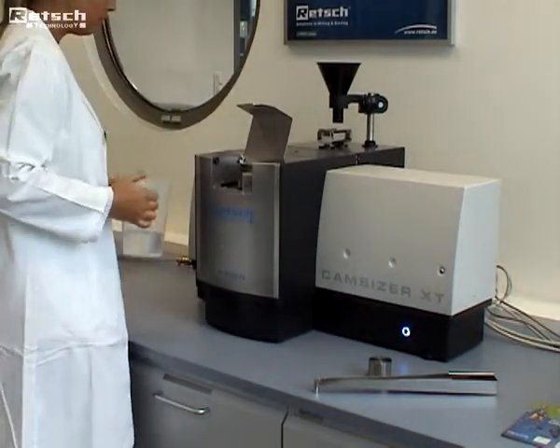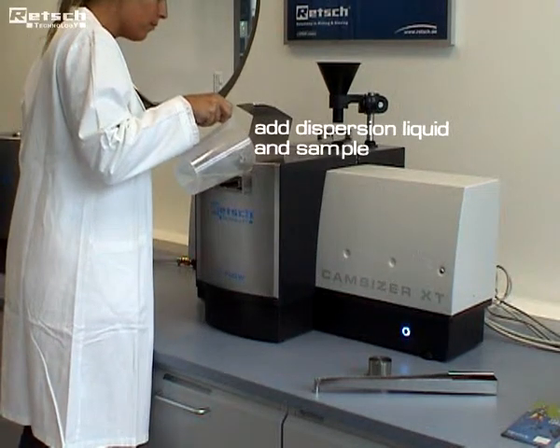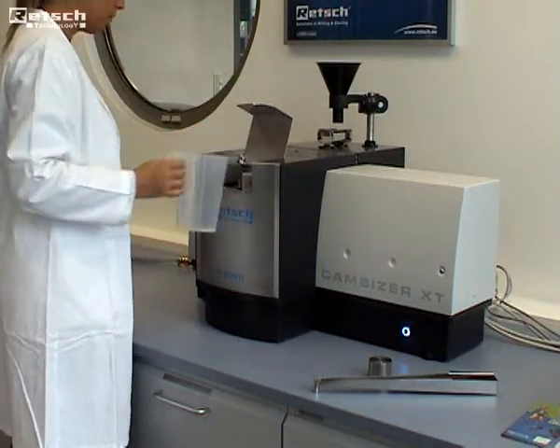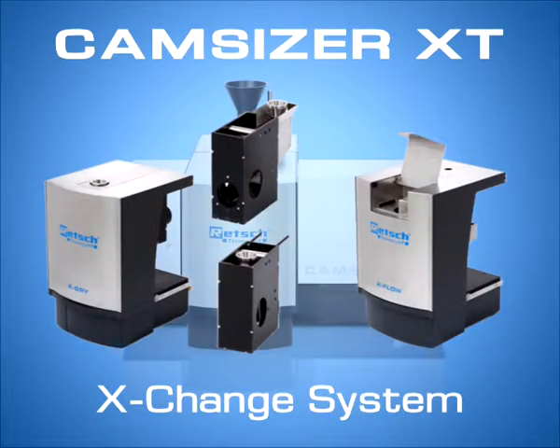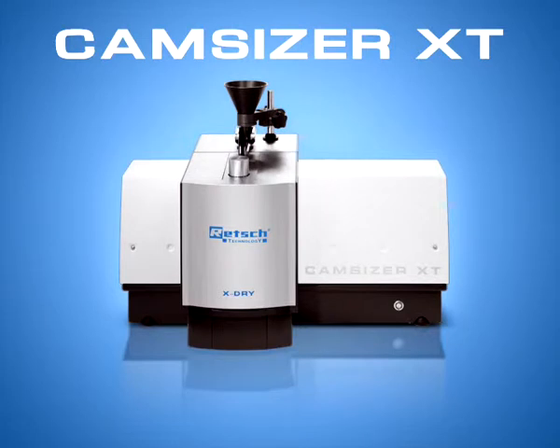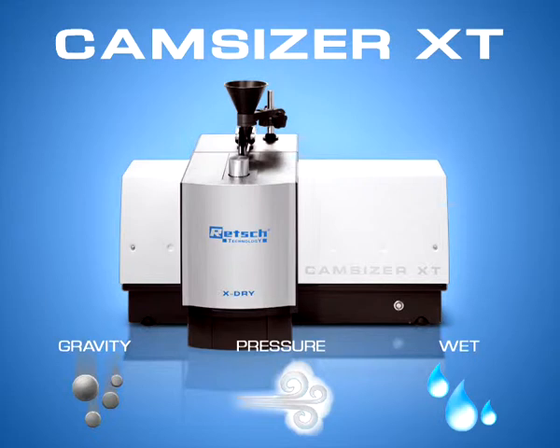After the dispersion liquid has been added, the sample can be fed and the measurement can be started. Using gravity, high pressure, or wet dispersion makes this instrument the ideal choice for precise and reliable particle size and particle shape analysis.